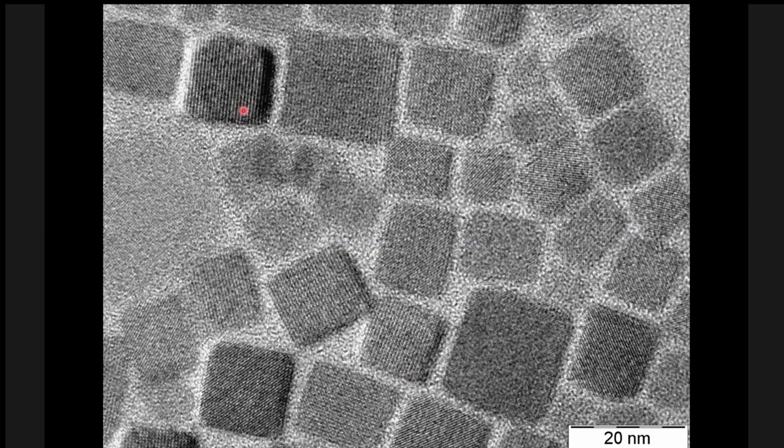Okay. Now come to this nanoparticle. Here in this case we see the same atomic lines at a 45-degree angle with respect to the edge. Now the question comes, are they going to have different properties, or why is it forming that one is perpendicular and one is at a 45-degree angle, and we see so many variations.